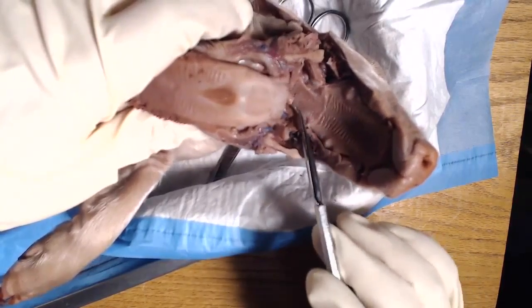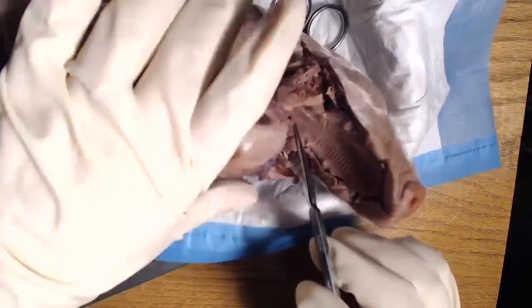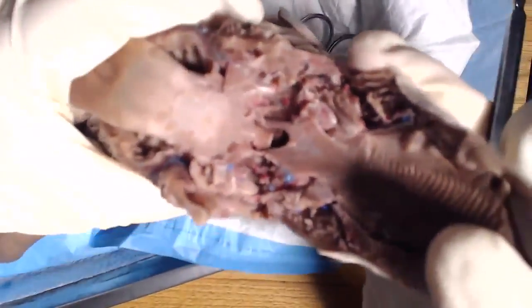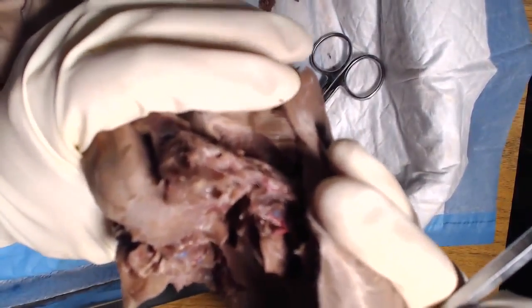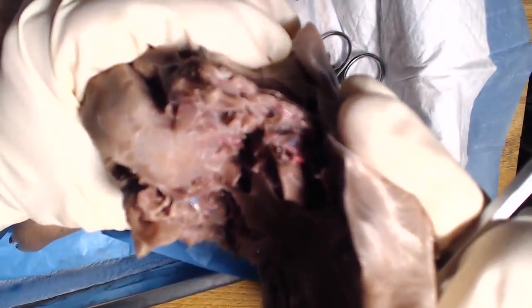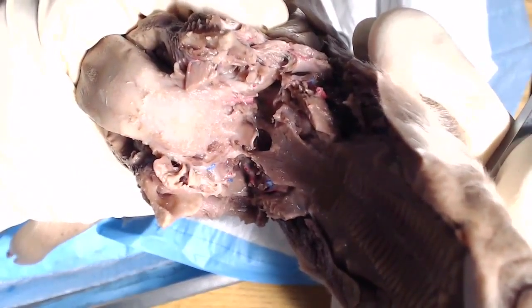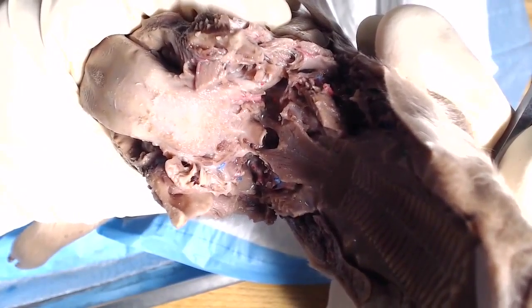All right, so the epiglottis, of course, covers your airway when you swallow food or swallow anything. So if you look at the epiglottis, you want to kind of pull the head back further, so you have this kind of view. Try and look behind the epiglottis, and you should be able to see the opening into the larynx, which is your airway, and then just behind the epiglottis, which you can see in my view, is the opening to the esophagus.